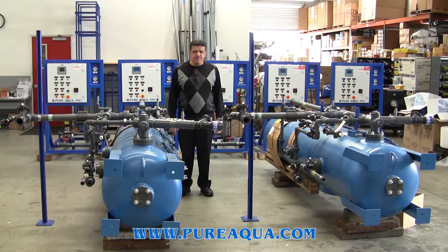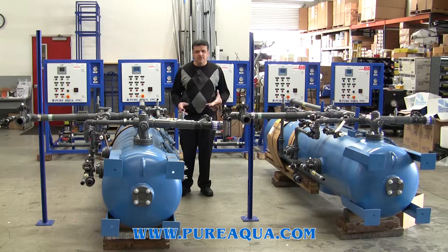As we see here, this is a mixed bed DI. The diameter of each tank is 24 inches. That includes the mixed bed resin, which is a combination of cation and anion resin.